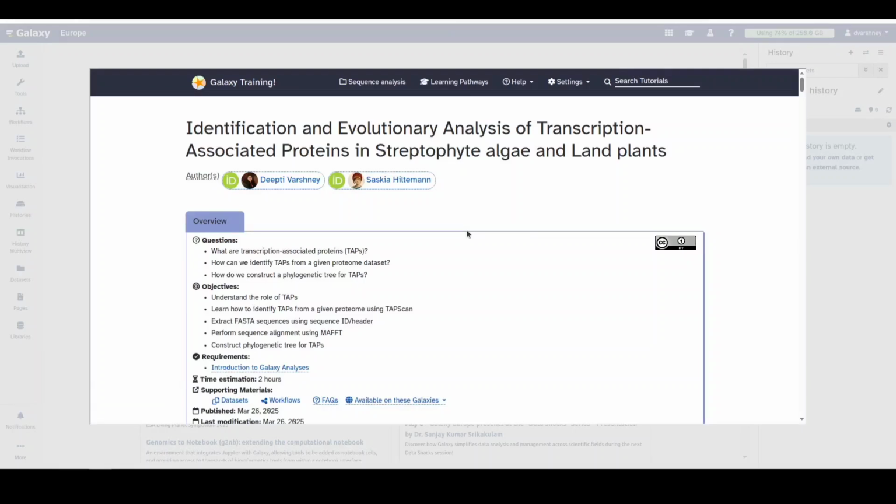I work with the European Galaxy team in Freiburg and my research focuses on plant genomics and related areas. Today in this video, we will be focusing on identification and evolutionary analysis of transcription-associated proteins in streptophyte algae and land plants.